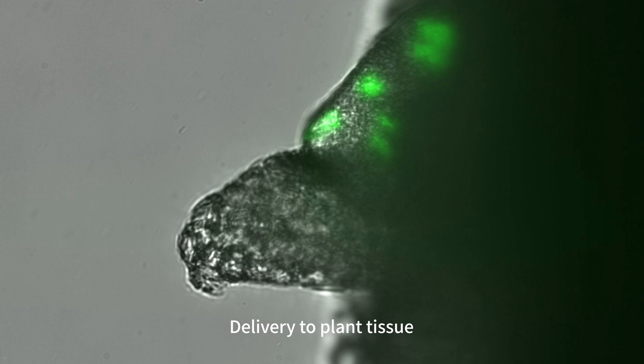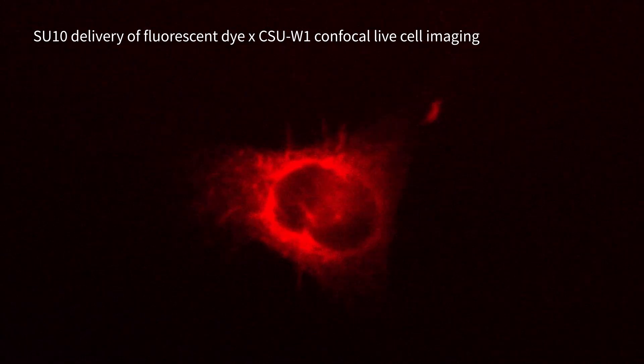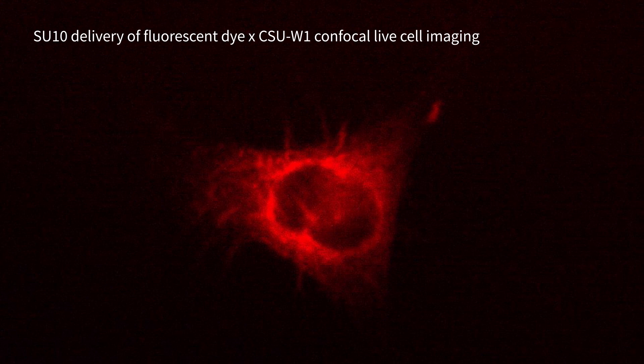The SU-10 also works superbly with live cell imaging techniques. During live cell imaging, you can observe relevant phenomena just seconds after delivery. The SU-10 can also retrieve samples of subcellular components.